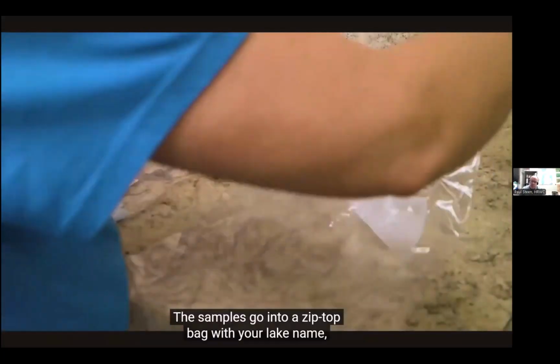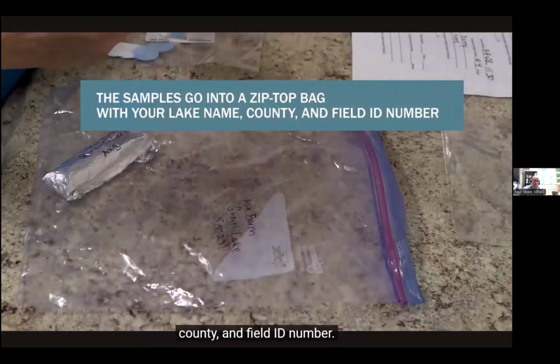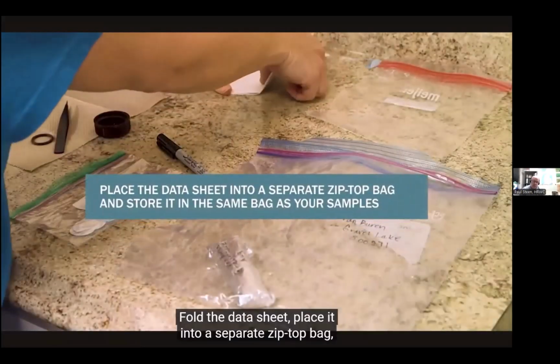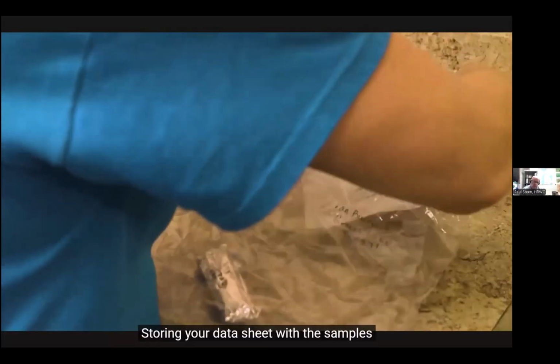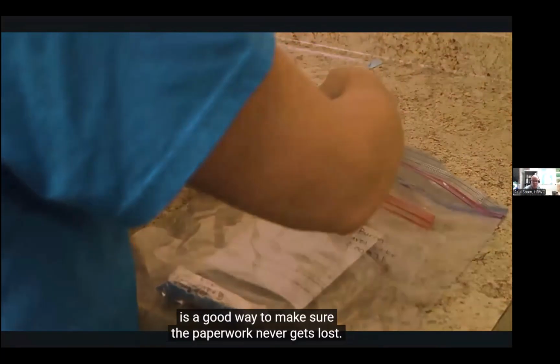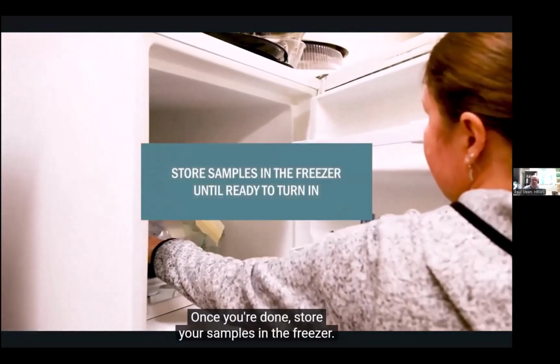The samples go into a zip-top bag with your lake name, county, and field ID number. Fold the datasheet, place it into a separate zip-top bag so it stays dry, and place that in the bag with your samples. Storing your datasheet with the samples is a good way to make sure the paperwork never gets lost. Once you're done, store your samples in the freezer.